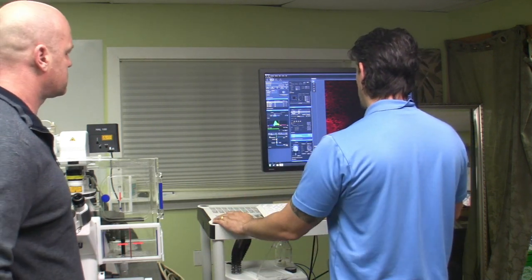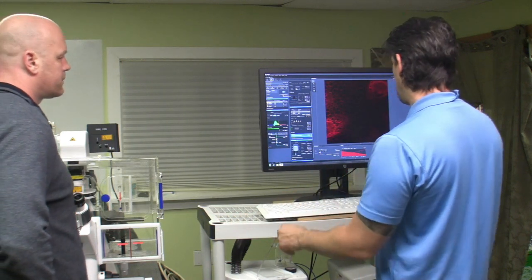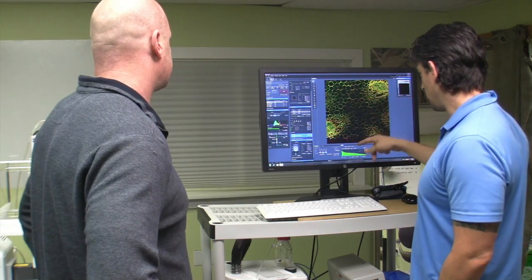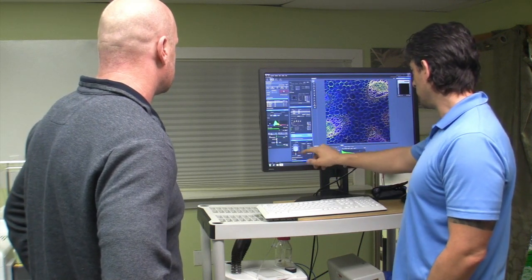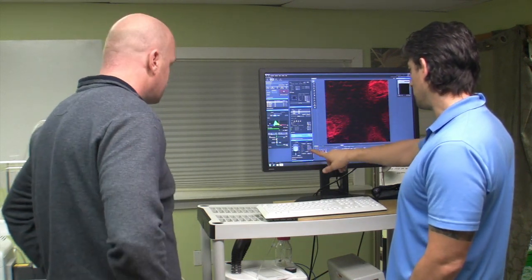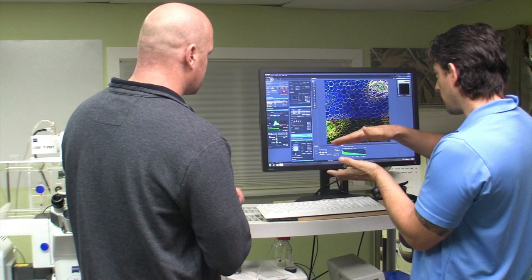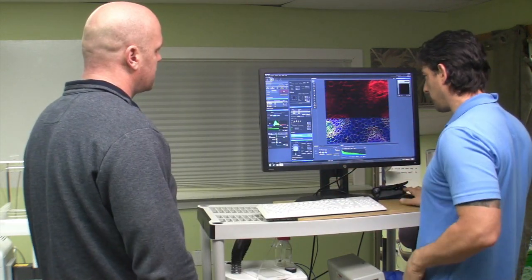This is going to take a minute because this is now a much more complicated experiment. So now it's doing an experiment instead of just doing one scan. It's starting right here, and it's going to take multiple images, and it's going to move up one slice. So it's taking an image and then it moves up a little bit, takes another one, another one, and then it puts them all together, and then it has a stack. So it's taking an image at different focal planes.